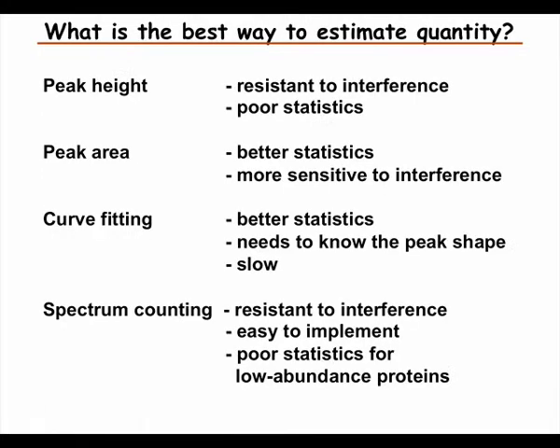But with this spectrum counting, we still have to specify the error allowed, right? Yes. So there is still a possibility there is some interference. Yes, but it's much smaller. So definitely I think the smallest risk for interference is in the spectrum counting method, compared to the other methods, which are much more sensitive to interference.